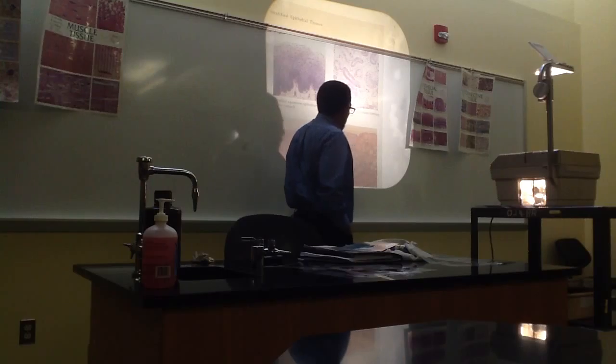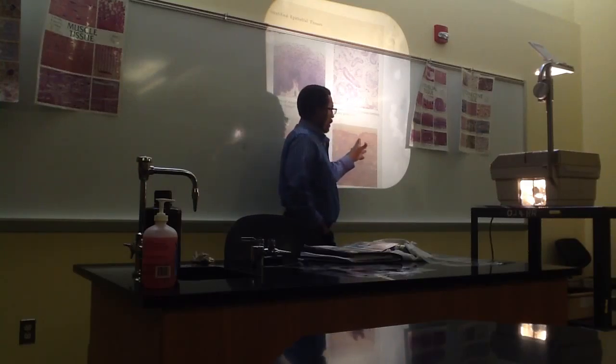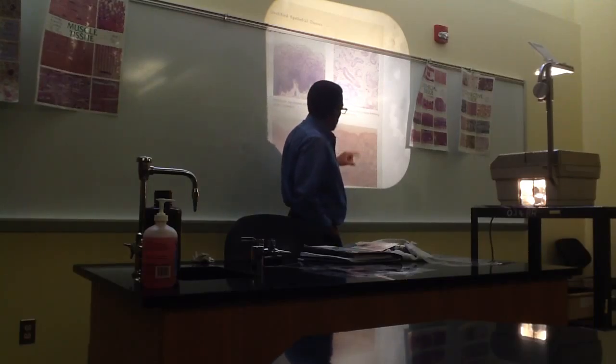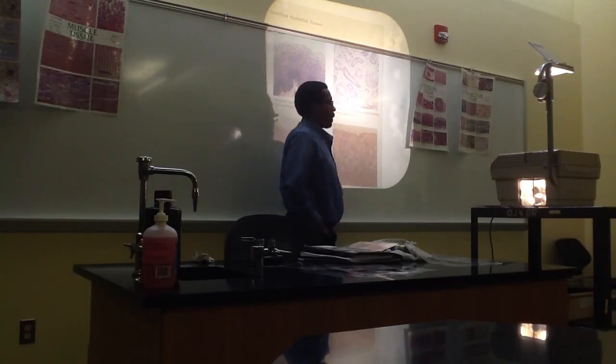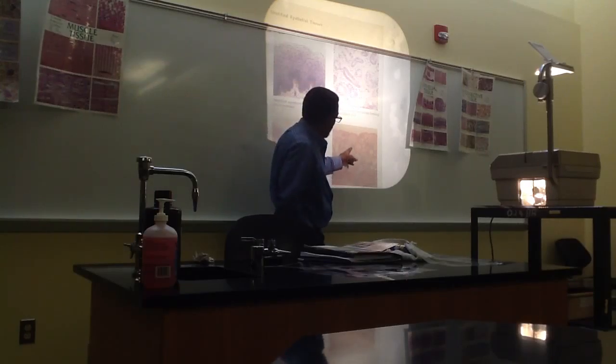It's going to turn out that these won't be classified according to the number of layers. It's just going to be classified because, all right, what kind of shape would you say these cells have? Transitional. Transitional. Good point. They look like they're almost about to turn into columnar epithelium.